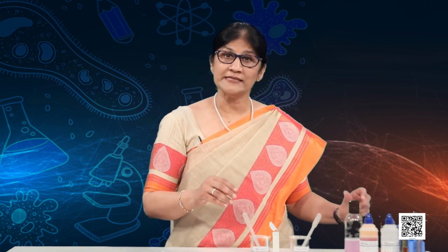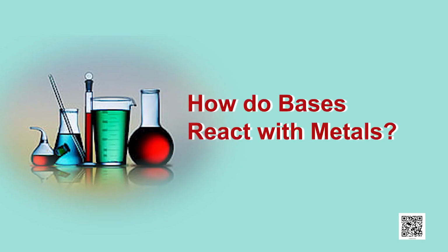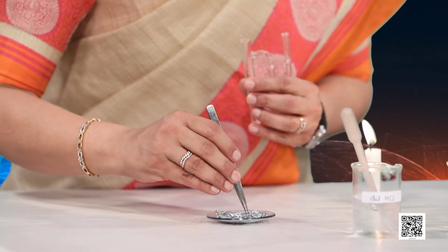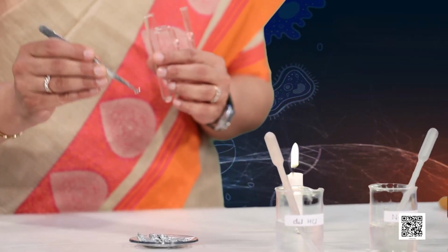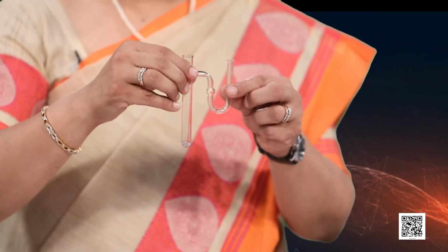Now, after seeing how acids and metal react, I wish to check whether bases also react with metals in the same manner. So, let us take another U-tube, a clean one, and pick up another piece of zinc metal. Can you see that I am not using my fingers to pick up the pieces? I am using forceps. All this is very important for scientists, to observe the precautions.